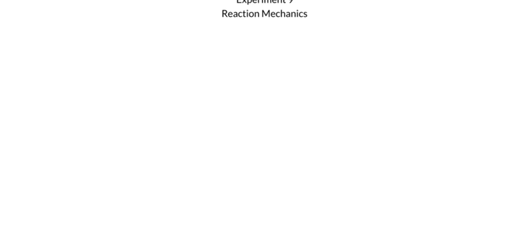Today's experiment, Experiment 9, will be about reaction mechanics. First, we will work on reactivity in single replacement reactions, in which we will be creating an activity series. Then we will look at some things that affect reaction rates, where we will look at both the effect of catalyst and of temperature on the rate of a reaction.